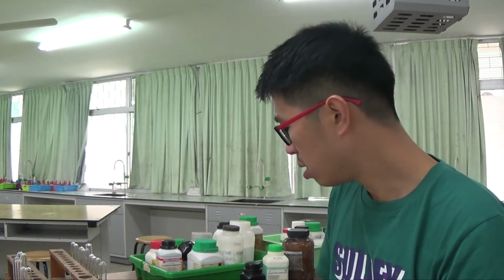In my other tutorial series I've talked about water of crystallization, and I've talked about the identification of ammonium ions, and also when you have the presence of ammonium as a double salt or ammonium nitrate, for example, a very tricky one. There was also another tutorial video on qualitative analysis where I talked about double salts, or a mixture of two compounds in one solid, where you are not only testing for one cation, you could be testing for 2 or 3 different cations.